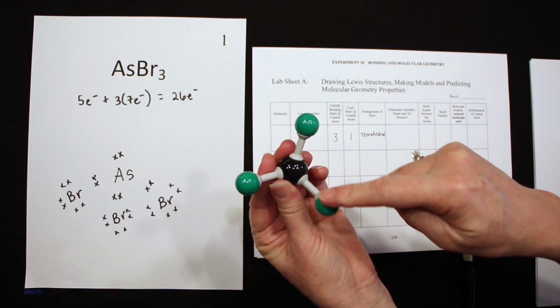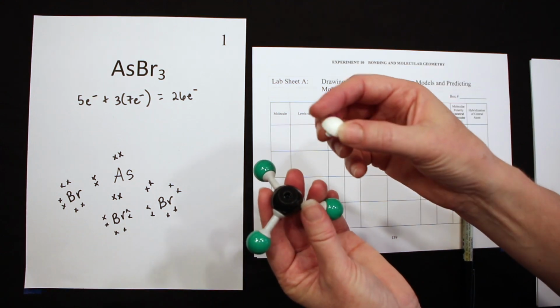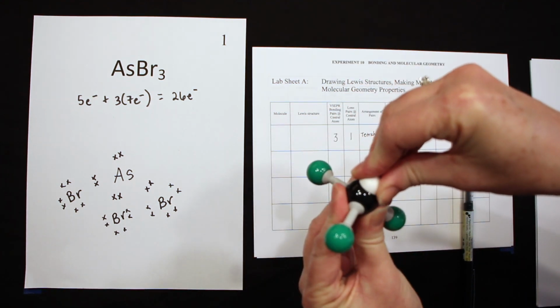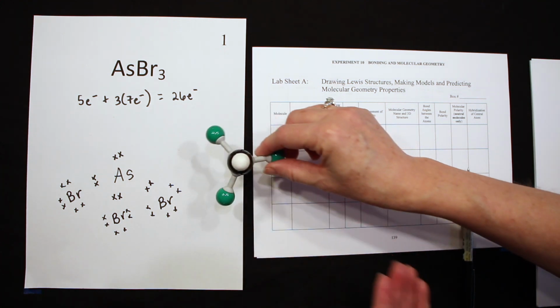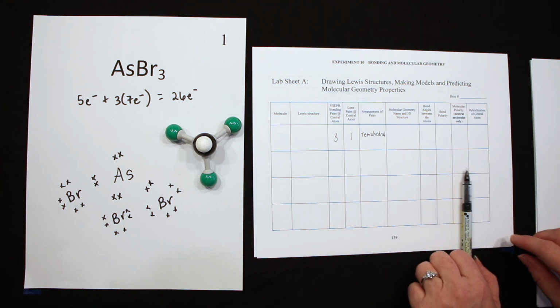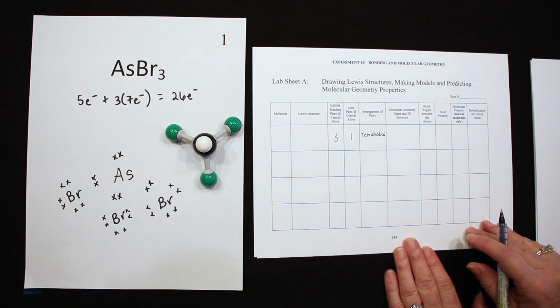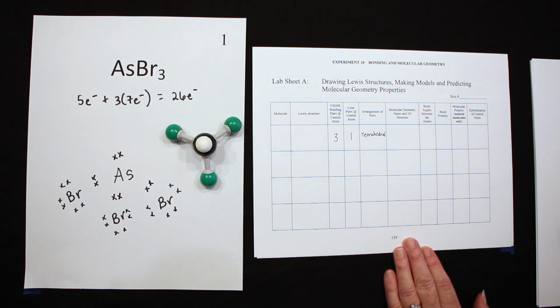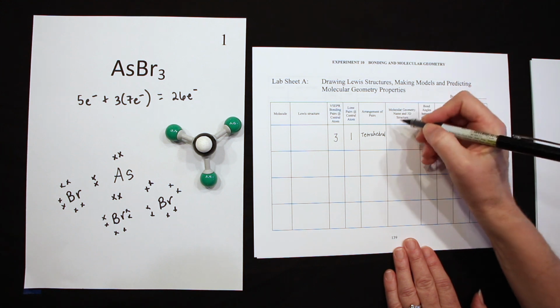There's my 3 bromine bonds. And I'm going to use this small half sphere to depict the lone pairs. And there is the molecule that we have built. You can refer to table 10.1 and you can see that that molecular geometry is trigonal pyramidal.